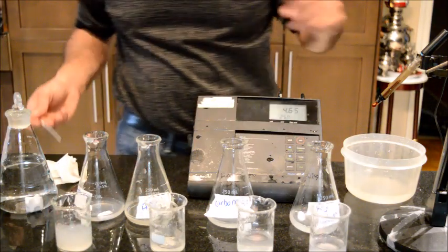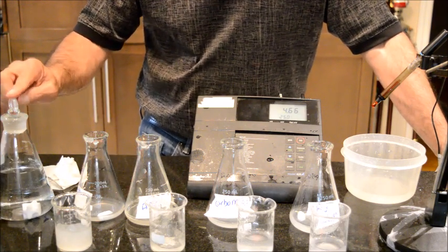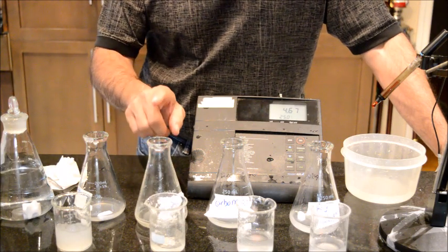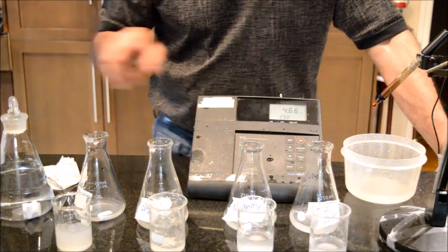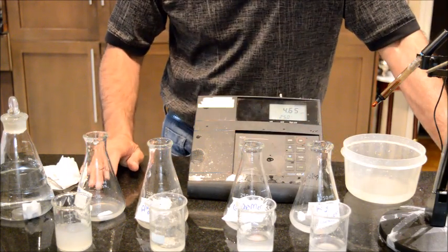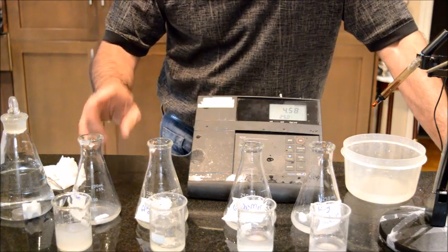So what is happening is that the simulated vaginal fluid contains calcium, and the calcium has a tendency to significantly increase the viscosity of the sodium alginate, and to significantly decrease the viscosity of Carbomer and Polycarbophil. And the calcium is more or less ineffective towards Xanthan gum.